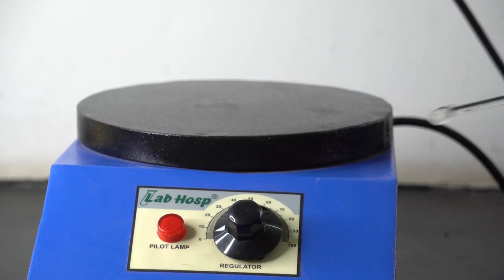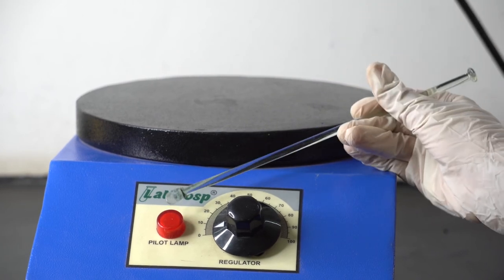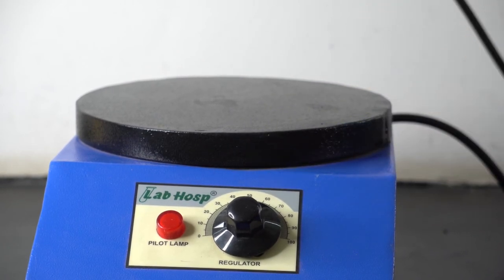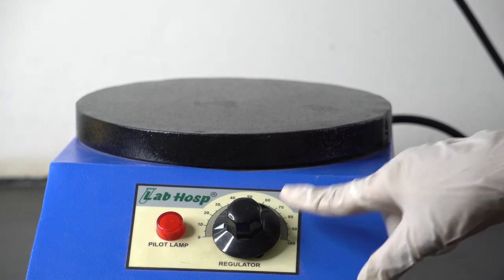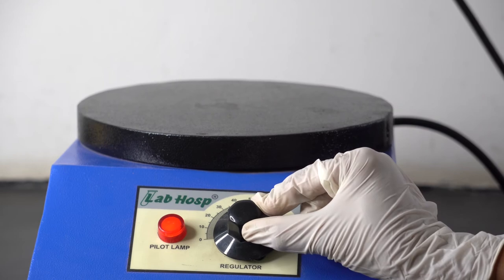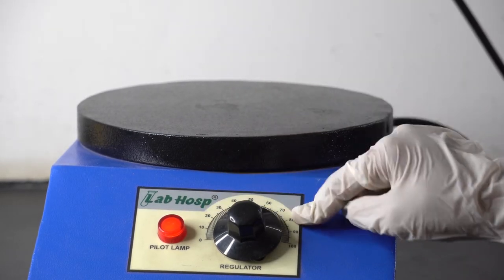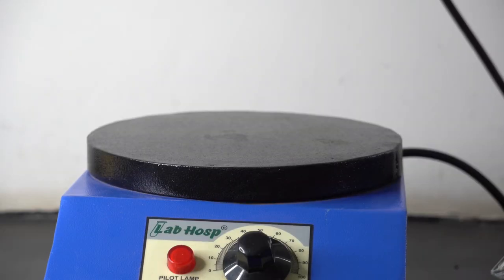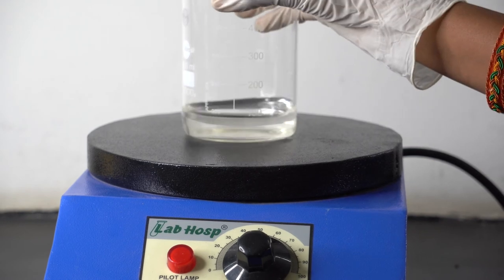As we can see on the hot plate, we have a pilot lamp and regulator to set the required temperature. Therefore, we can set the temperature on low, medium, and high with the help of the regulator knob. Now put the sample container on the hot surface.